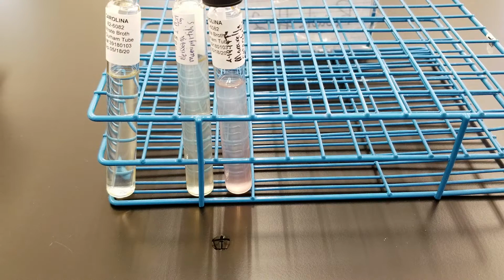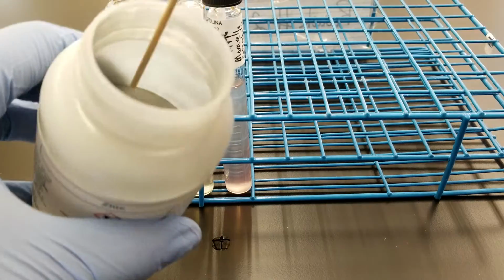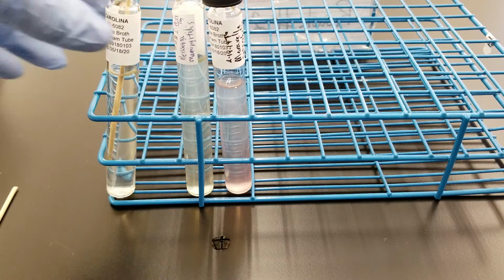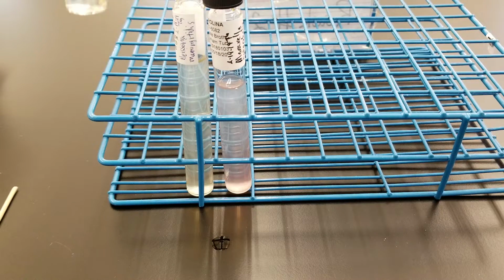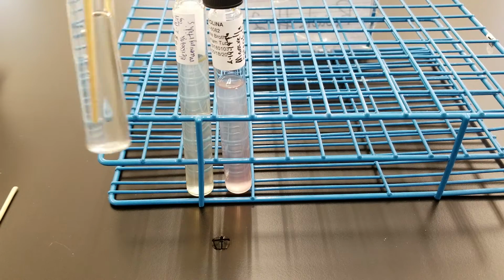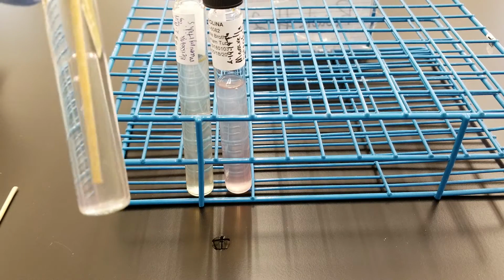Let's do the stick one first. So the idea of the stick is that you can literally put it into the zinc. Okay, you just stick it in there, and whatever comes out on the stick should be enough to make it change color appropriately. And anyone who uses this type of technique likes the idea that you can leave the stick in there to show that the process was done. However, does not look like I really got much on there.